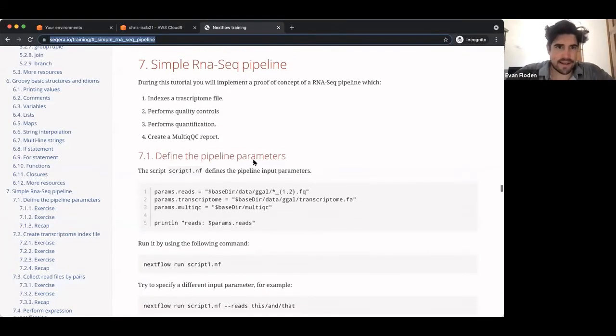So I wanted to jump in now and start to build a pipeline from scratch. We're going to build up the steps that we have for a pipeline, starting from the early parts of it. We're going to begin from just building the parameter, adding our individual steps, and then launching there. Okay. So I want you to jump ahead to section number 7 here.